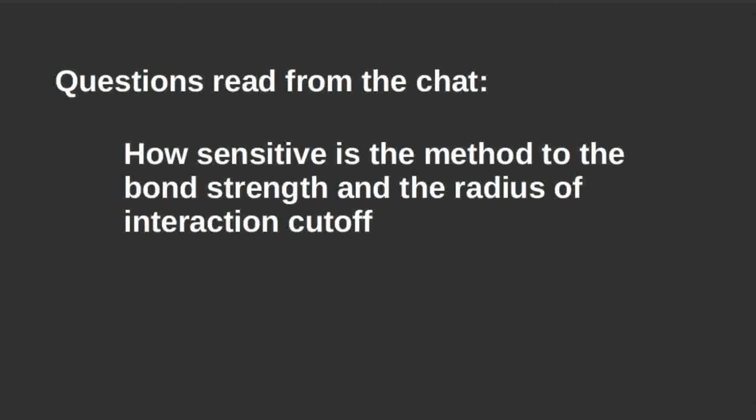So you can externally check what value for the cutoff would work better. Because if the cutoff is very small, then you get something that is very, very flexible. If the cutoff is too big, then you get something that is very rigid. If it's very rigid, then you get very few modes. For example, you want 20 modes, but the program will give you only 12. And there are some messages to guide the user.